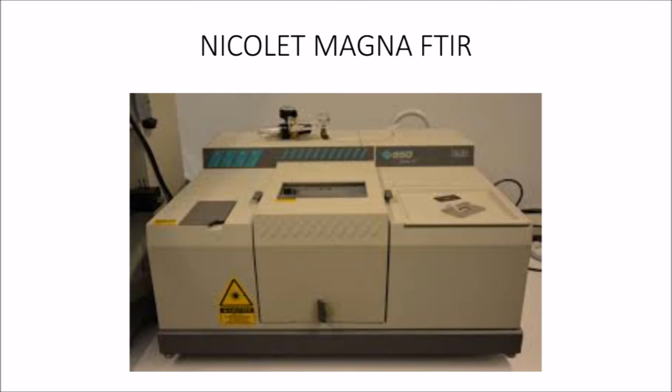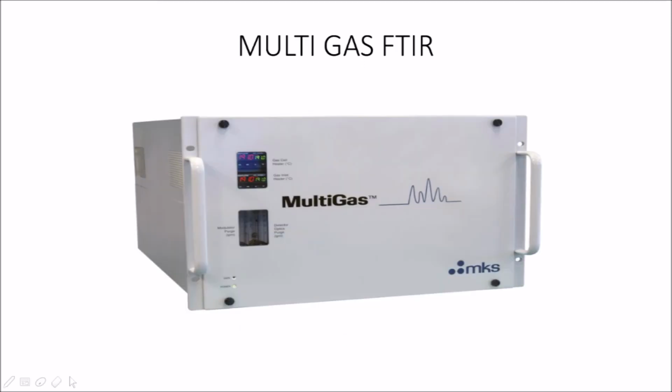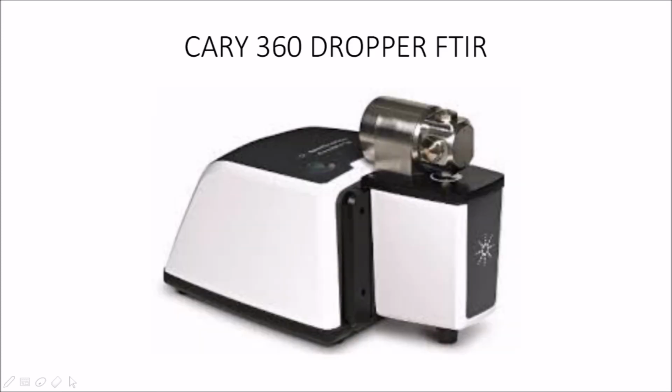The fourth picture is the Thermo Fisher FTIR. The fifth picture is the multi-gas FTIR. And lastly, the sixth picture is the Cary 360 FTIR.